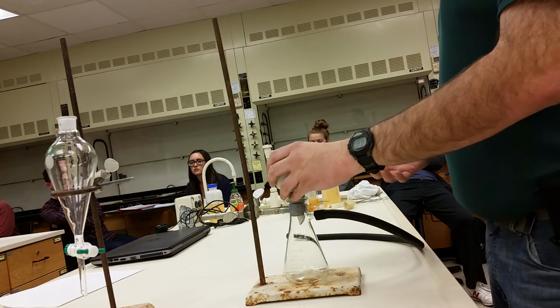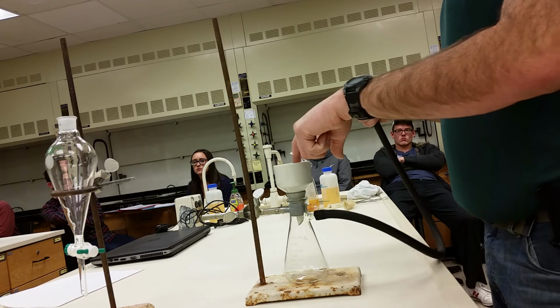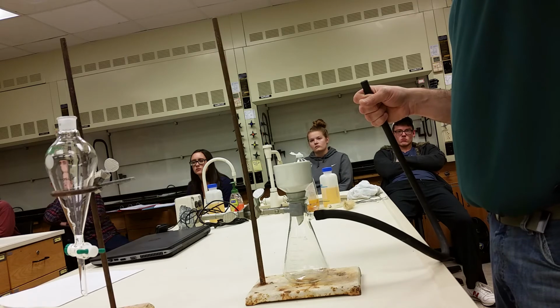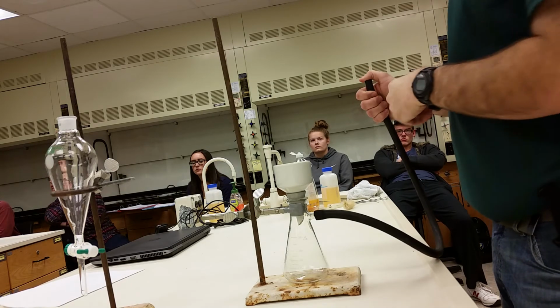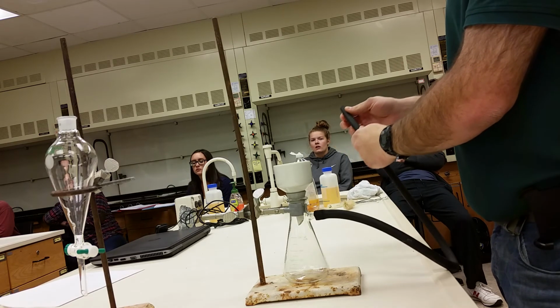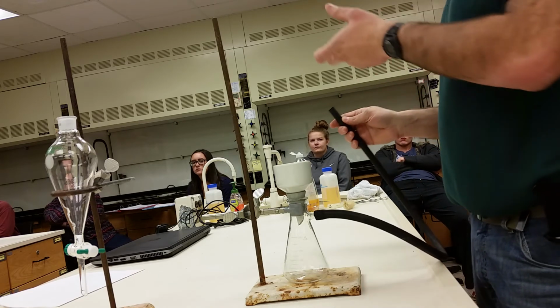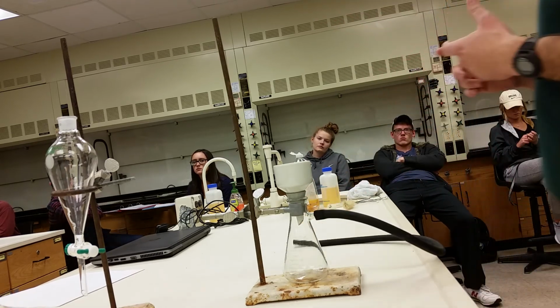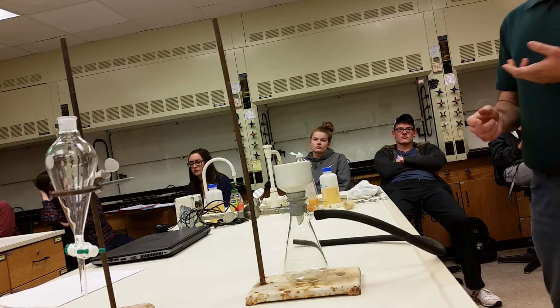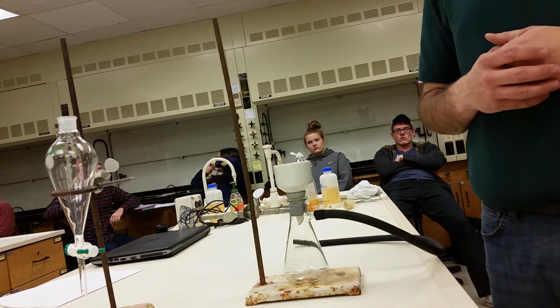Okay? So, when you're ready to go, take some cold water and wet the filter paper, which you can get from the shelf at the front of the class. Connect the tube to the yellow port in your hood. Turn on the valve for the vacuum. Please do not attach to the air or the gas. It would be very bad to put pressure in here and have this shoot off into the atmosphere.